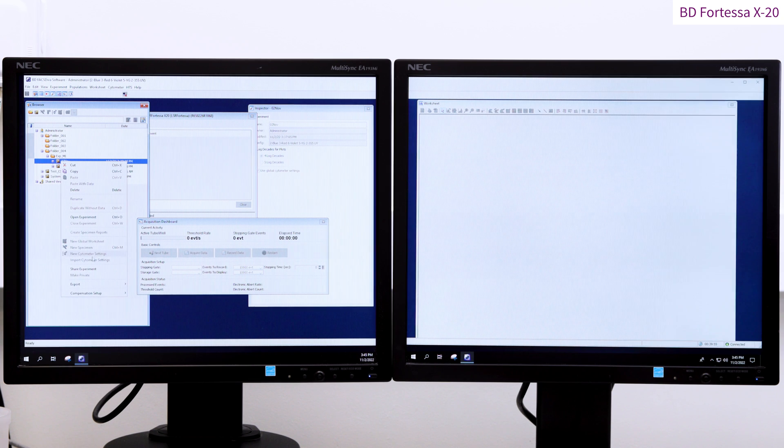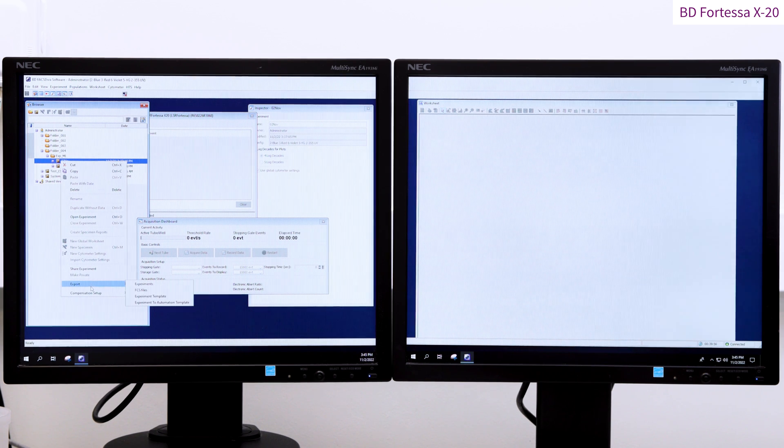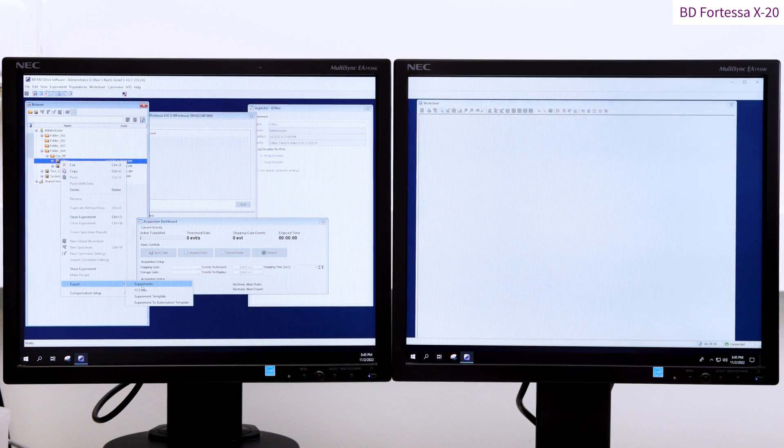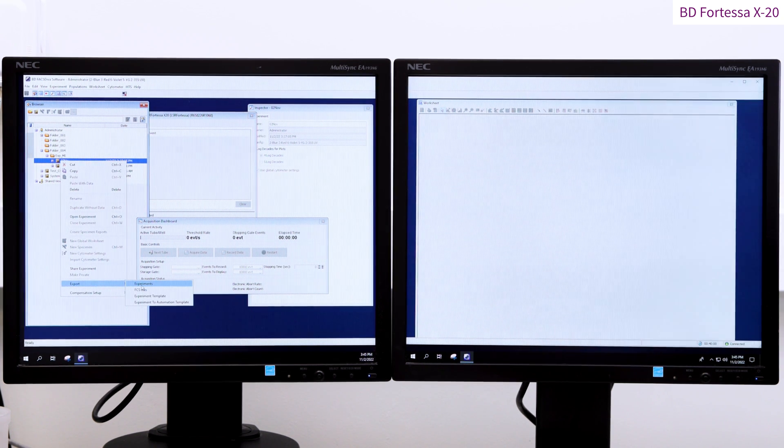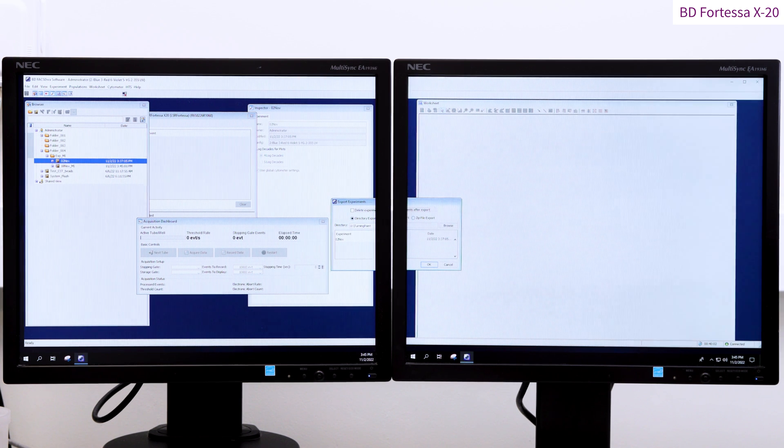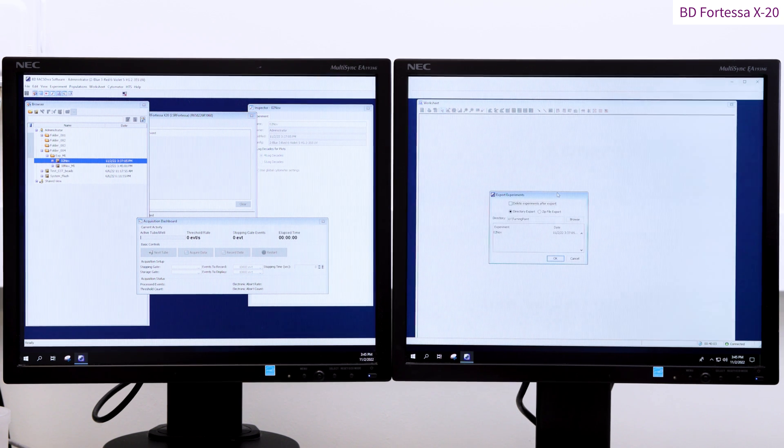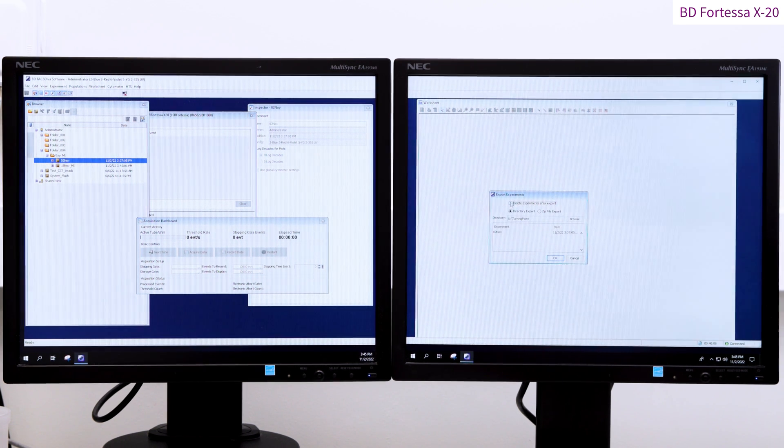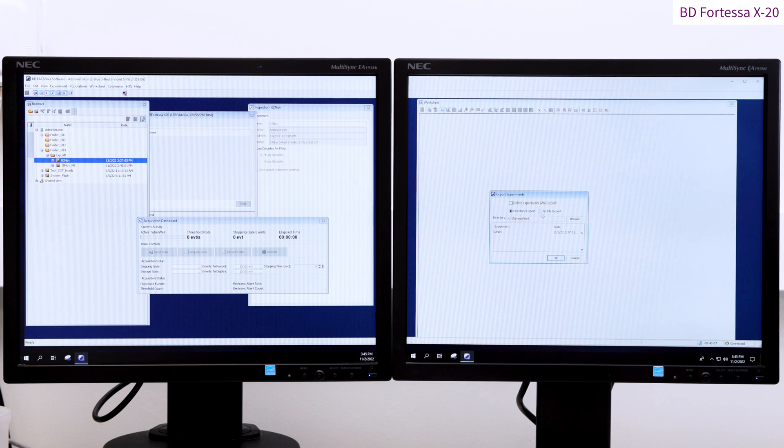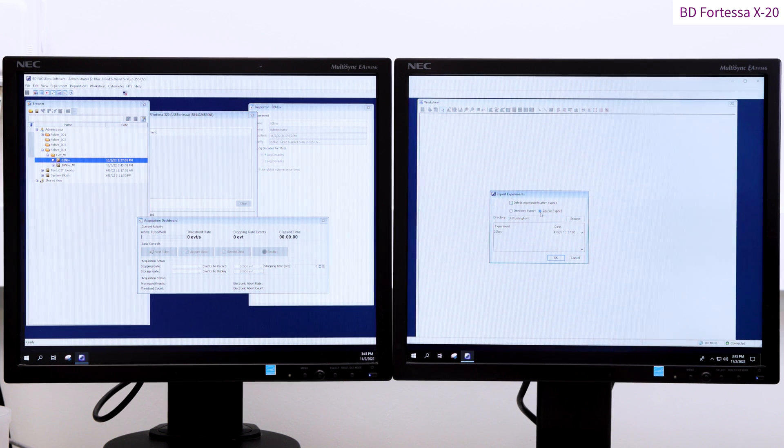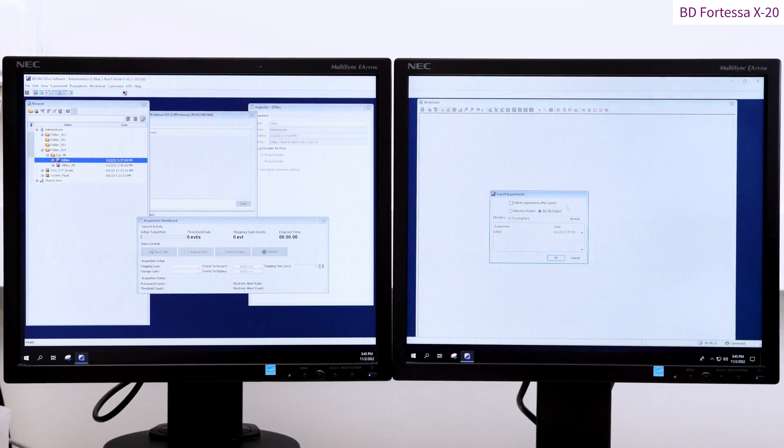Should you wish to back up your data under the diva software format, right click on your experiments, choose export on the drop down menu and select experiment. Saving the data under this format gives you the same advantages of the experiment template while preserving the data you have acquired.